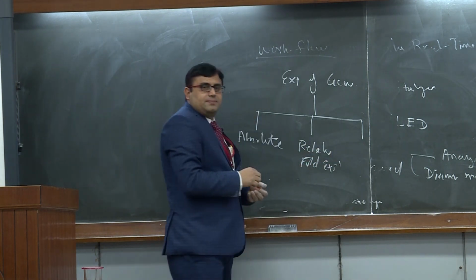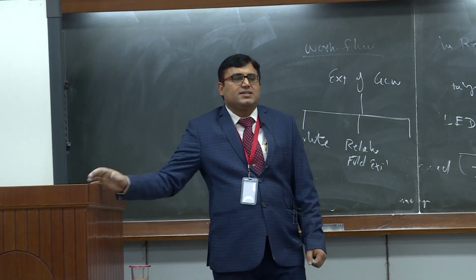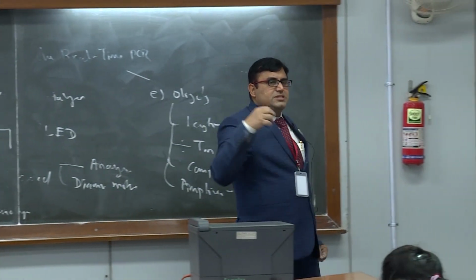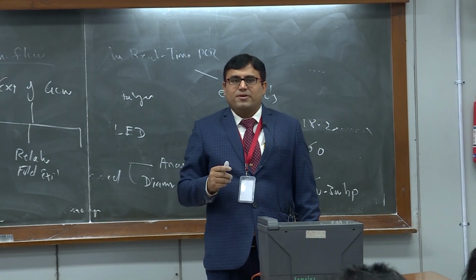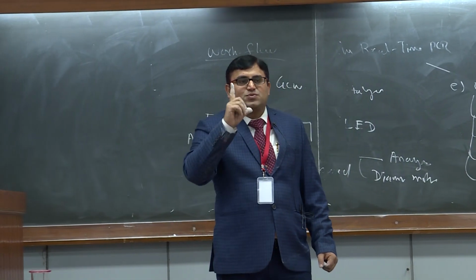relative fold expression. Relative fold expression means, here you are going to quantify the threshold cycle value of all the reactions, and then you are going to present your result in comparison to the expression of your control, right? For the control sample, we designate a number as 1.